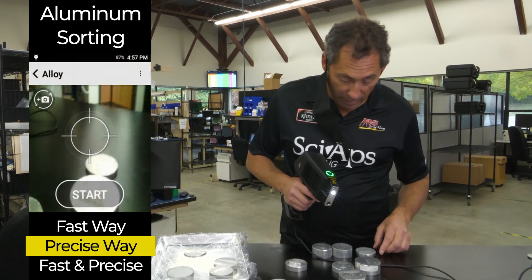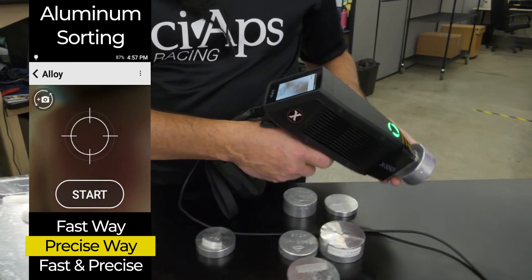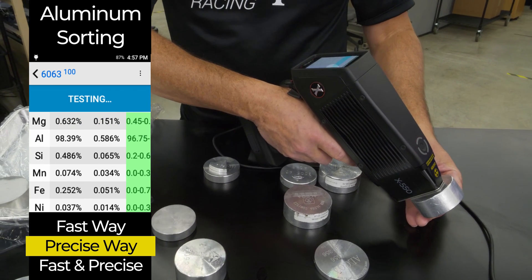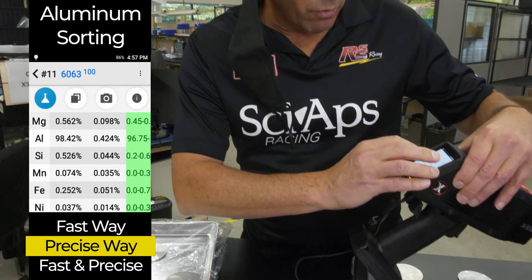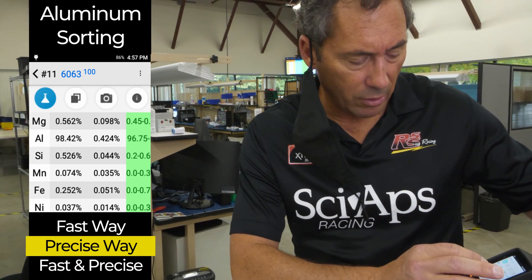Let's start out with my favorite — 6063. When I shoot 6063, it comes up and then it flips over. Now you're measuring magnesium and silicon. You can see it's a perfect match to 6063. We're now measuring about 0.5% magnesium and the silicon that's in the alloy.